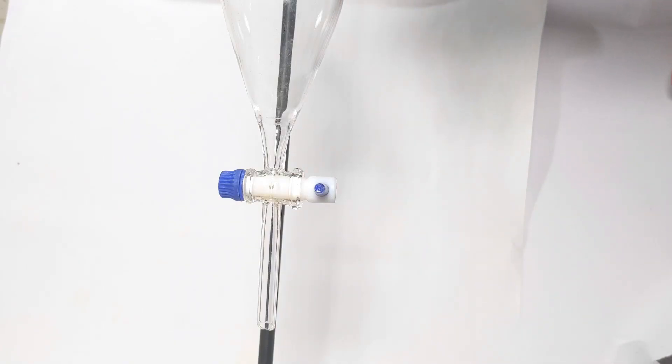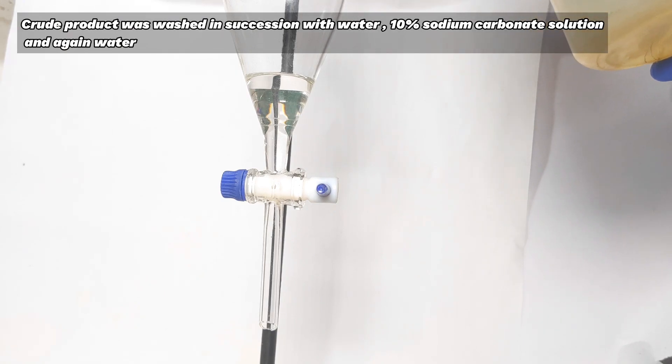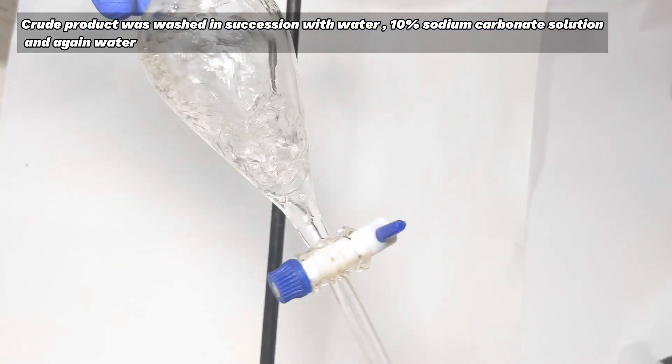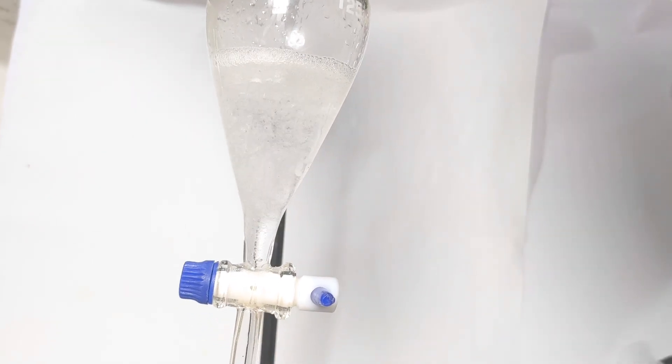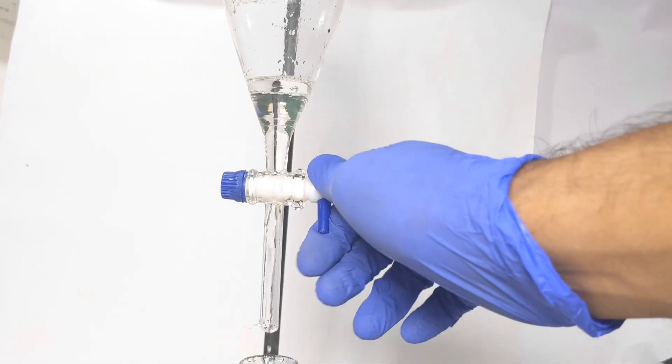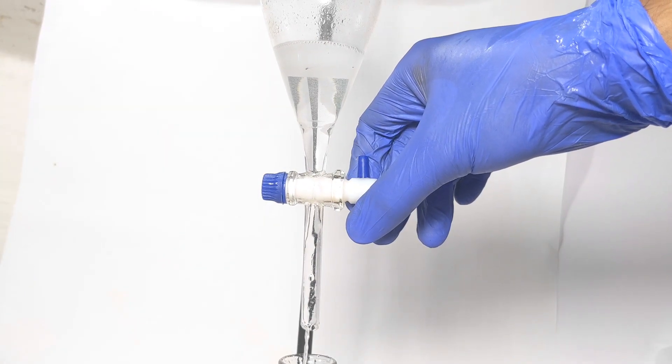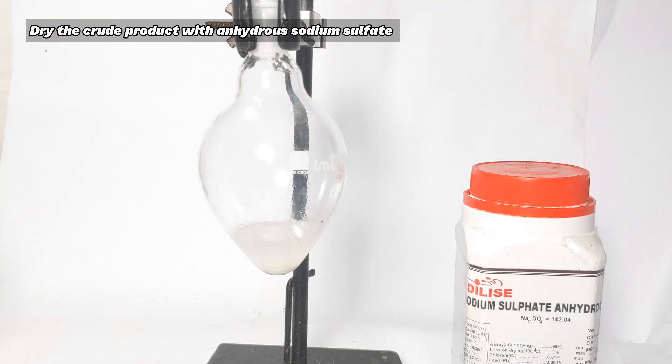It was then transferred to a 125 ml separatory funnel, and then the crude product was washed successively with distilled water, and then with 10% sodium carbonate solution, and again with distilled water. This would give us a somewhat pure product which would be having lot of water in it. So to remove the water we will be adding anhydrous sodium sulphate, and we will get a clear solution.